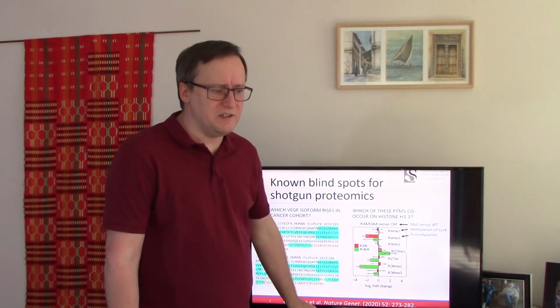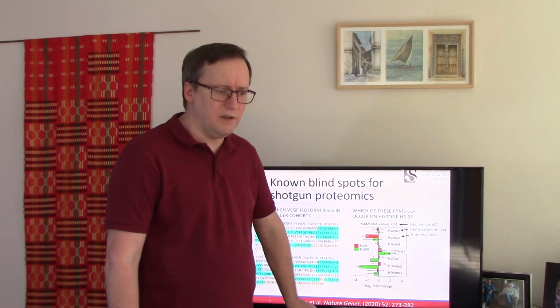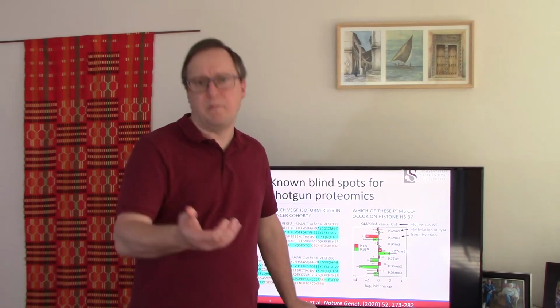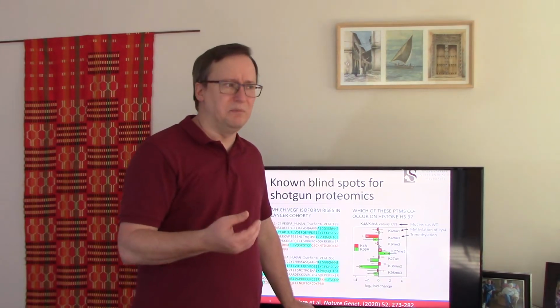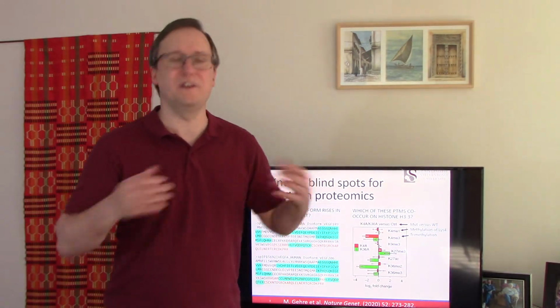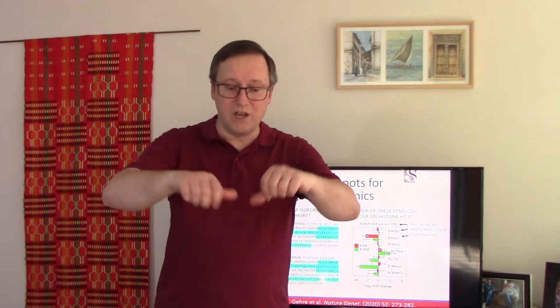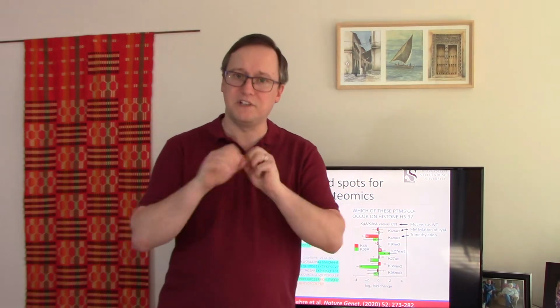All right, so let's try to ask the question from another light. If you are, like me, from the bottom-up proteomics world, you're probably accustomed to the way things are done. And the way things are done is that you cause your proteins to denature, you reduce the disulfide bridges and alkylate those, and then you hit the thing with trypsin and it cuts it up into a bunch of peptides.